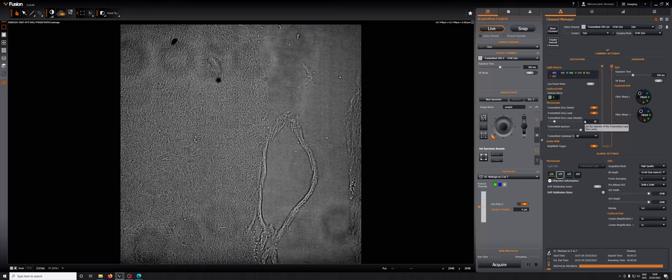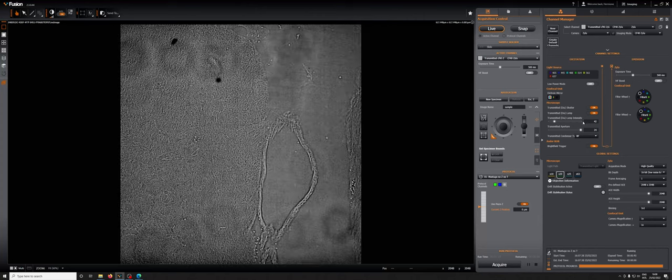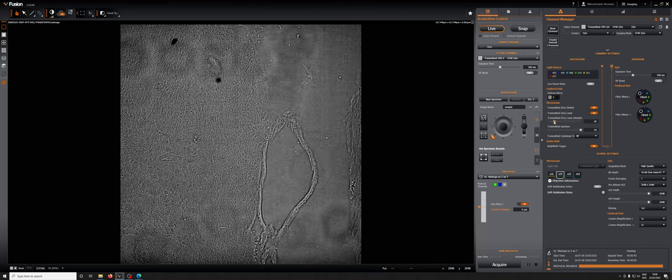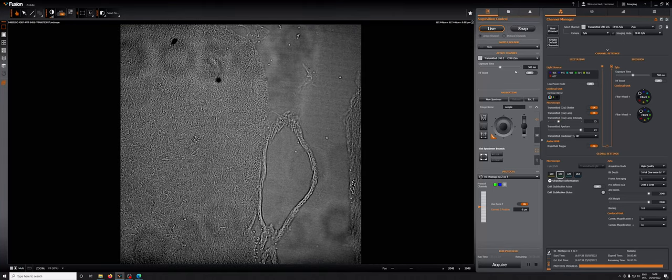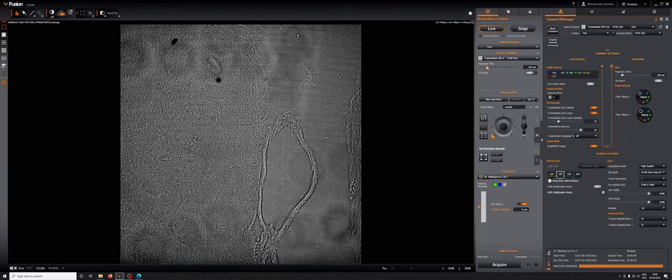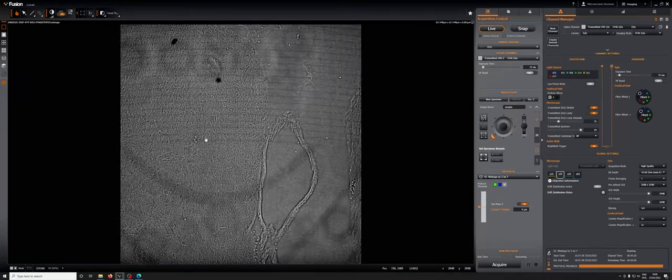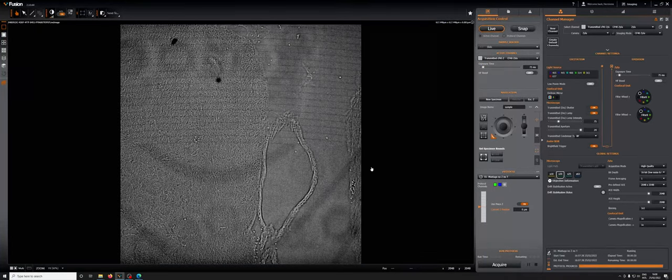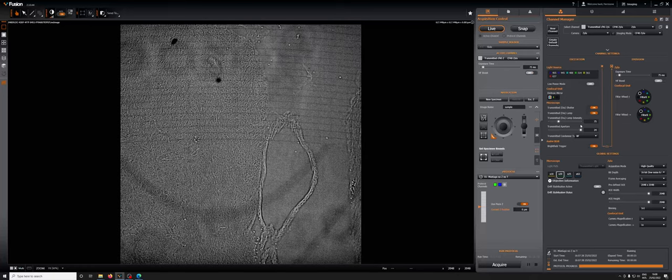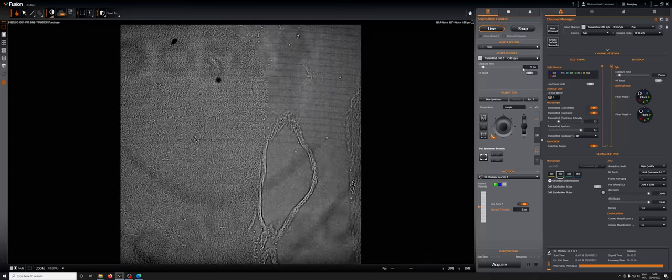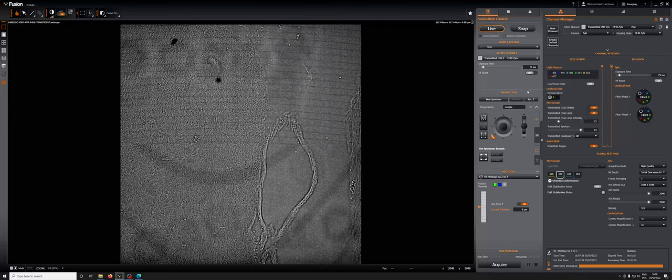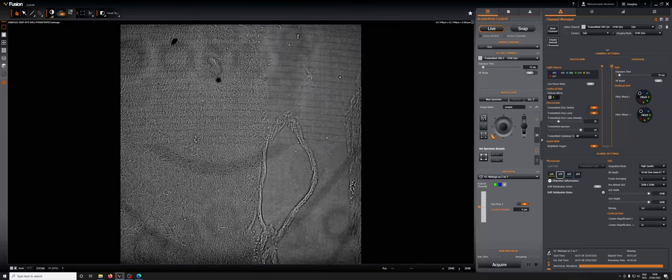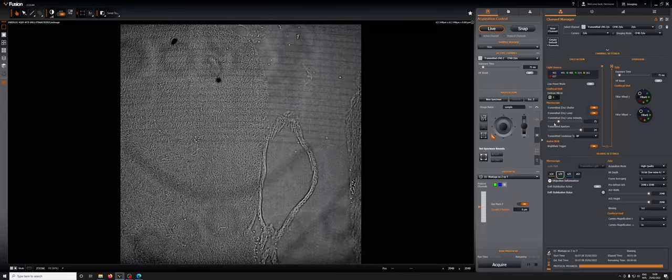The problem is that because the light is going through the confocal, if you increase the light intensity or reduce the exposure time you get nasty artifacts, particularly if you do them combined. You can see all of these lines are a result of the combination of low exposures and high intensities. Obviously low exposures would be nice because of speed but if we go with low exposures we can't avoid these problems.